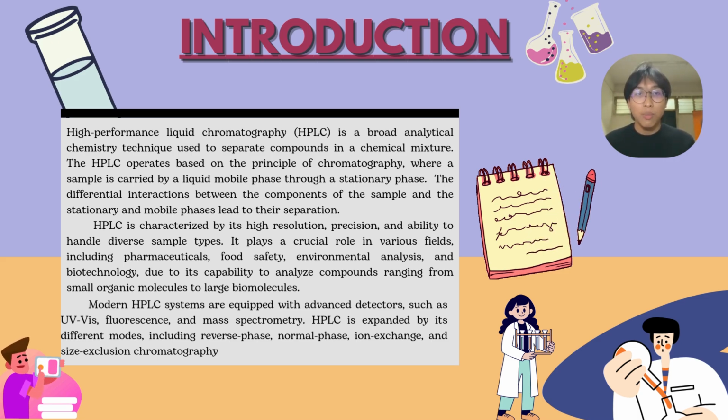HPLC is characterized by its high resolution, precision, and ability to handle diverse sample types. It plays a crucial role in various fields, including pharmaceutical, food safety, environmental analysis, and biotechnology, due to its capability to analyze compounds ranging from small organic molecules to large molecules, such as proteins and nucleotides.